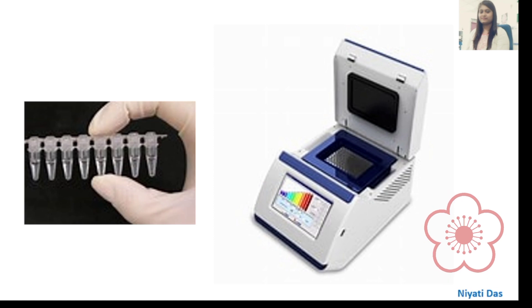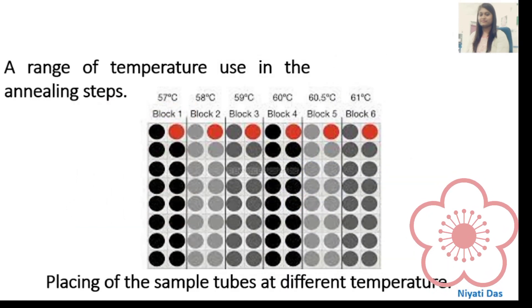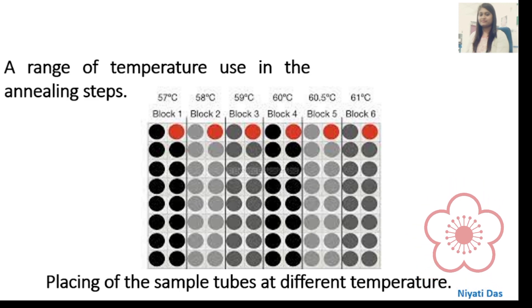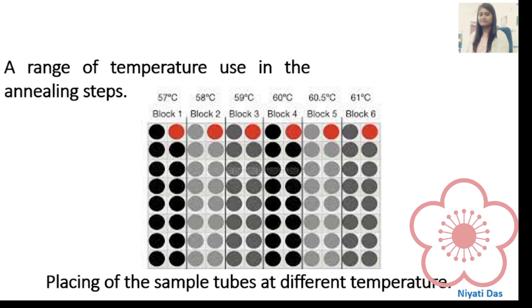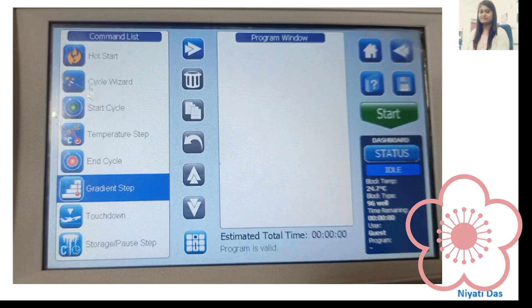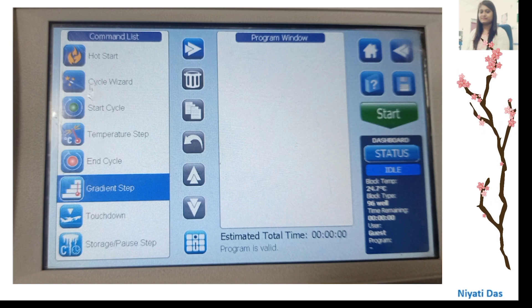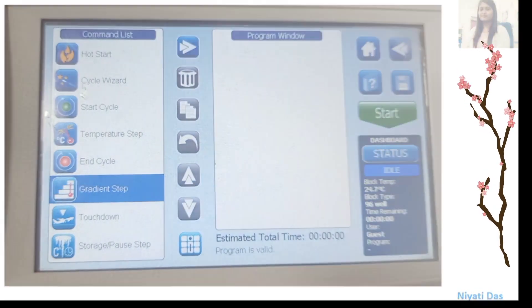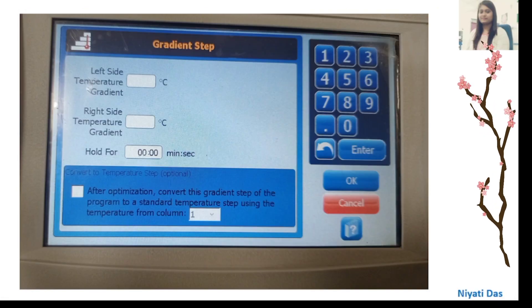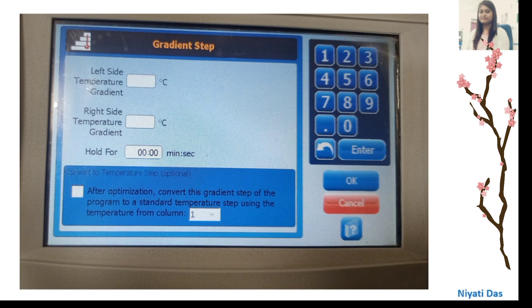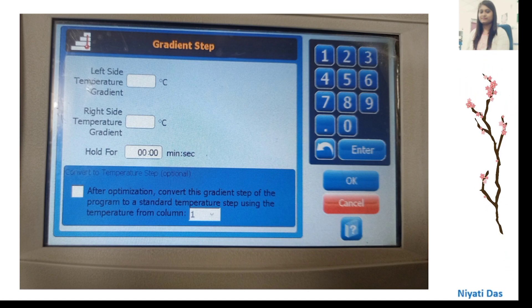Now we go to the thermal cycler to set up the program. In the annealing step, we use a temperature range — here I am showing a range of 57 to 61 degrees Celsius. In the gradient step of the thermal cycler method, we run different annealing temperatures instead of a single fixed annealing temperature.